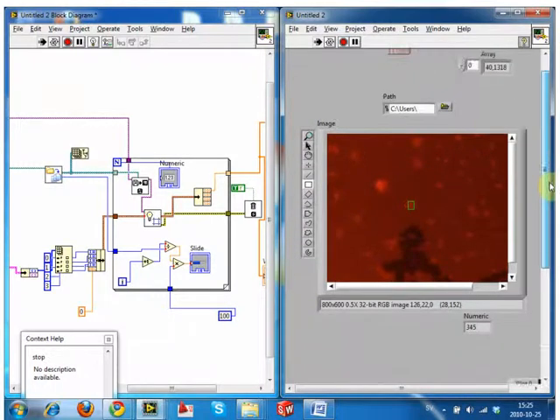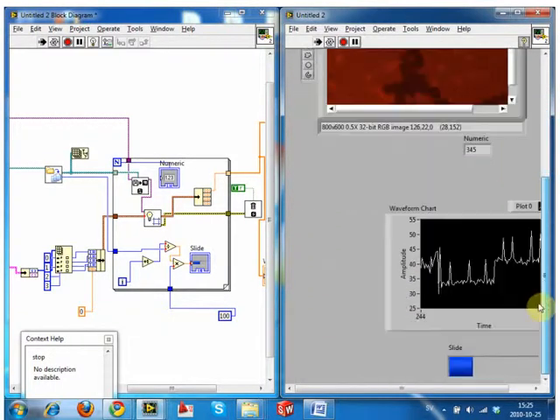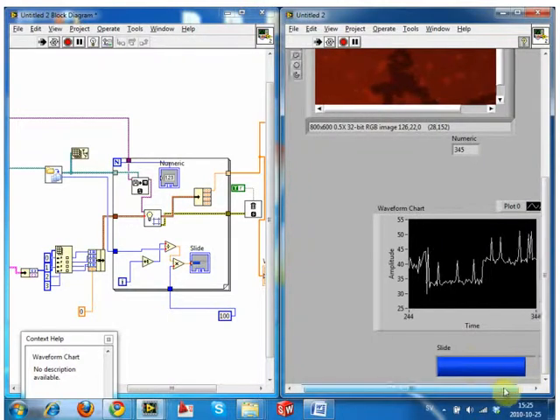Does it wipe the whole series of images, or does it wipe every image individually? It wipes everything at the end. It waits till it's done and then it destroys it. So memory is filled with 300 something images.